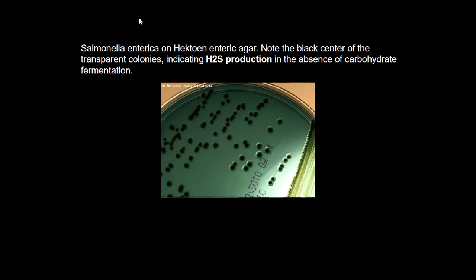So for the media that we use for the isolation of the pathogens in the stool, like for example the MacConkey agar, we concentrate on the lactose non-fermenters. We could also use other media like the Hektoen enteric agar, also for Salmonella and Shigella, Hektoen we call it.